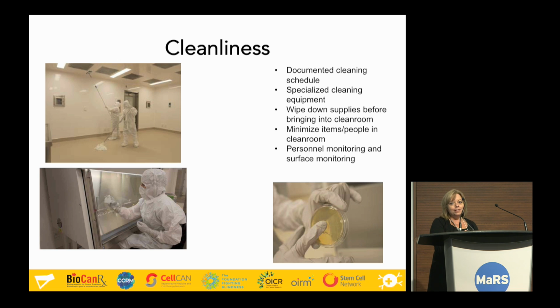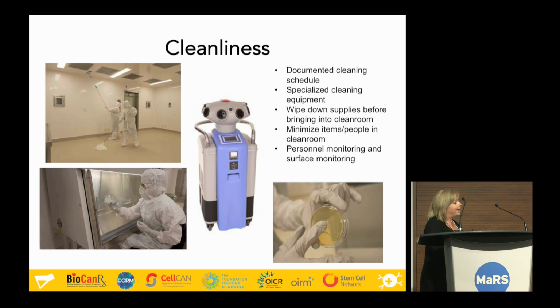And as an added bonus, in our facility we have this guy, and after we manually clean everything, we can put this in the room, and it uses vaporous hydrogen peroxide, and it kills everything. They actually used one of these in the airplanes that were potentially contaminated with Ebola in the States, so it does its job.